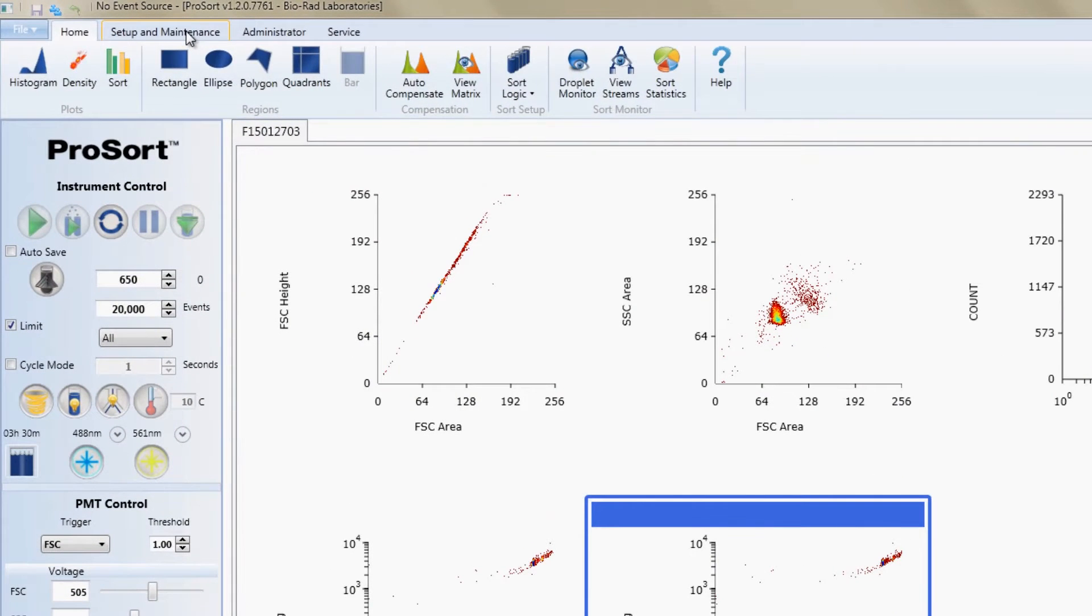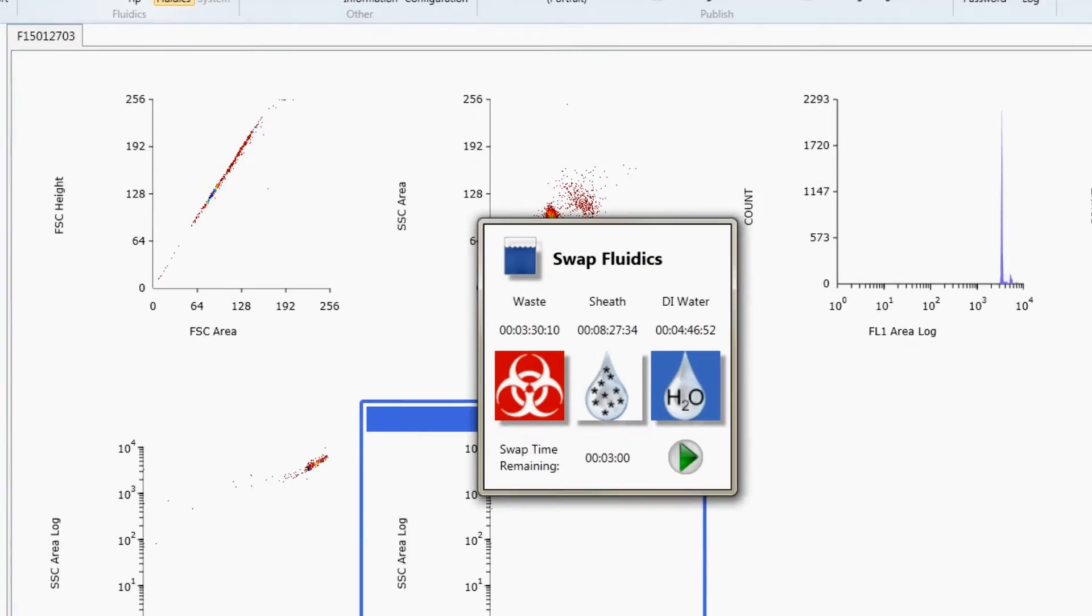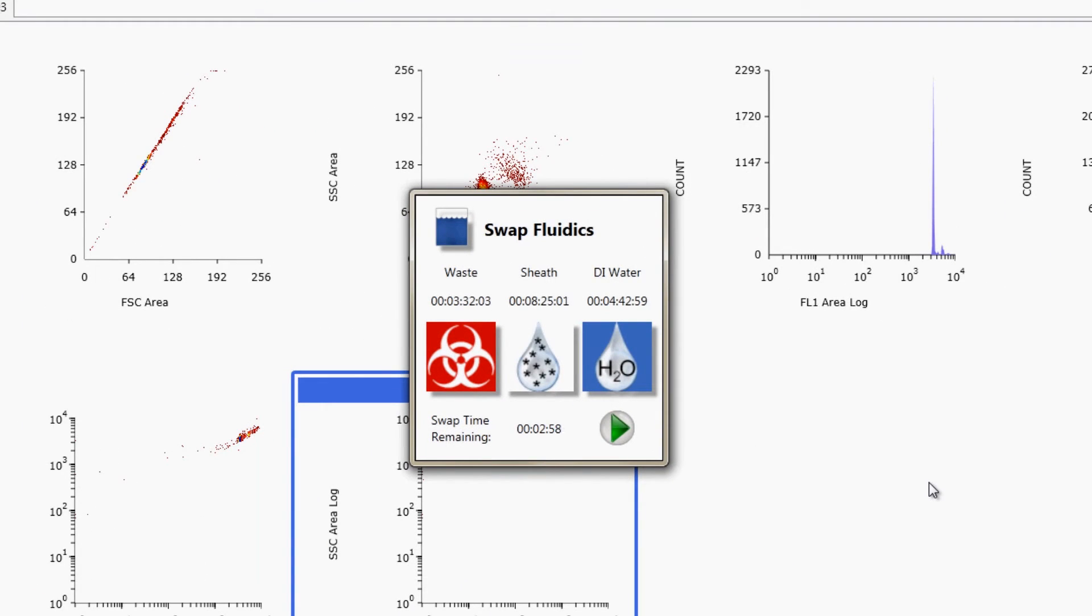Next, go to the Setup and Maintenance tab in the ProSort software and click on the Swap Fluidics button. This will automatically start the 3 minute countdown timer for the fluidics swap.